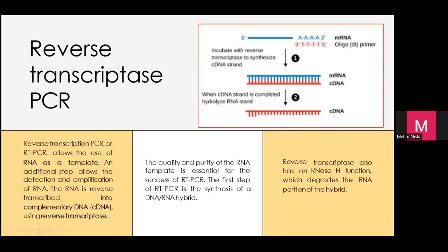Sebab selepas RNA kita akan pergi ke protein. So dia ni bersih sikit. So what we need, setengah kajian kita kena guna RNA bukan DNA. Tapi ini kena ditukar balik ke DNA. So that's why the name is reverse transcriptase PCR.